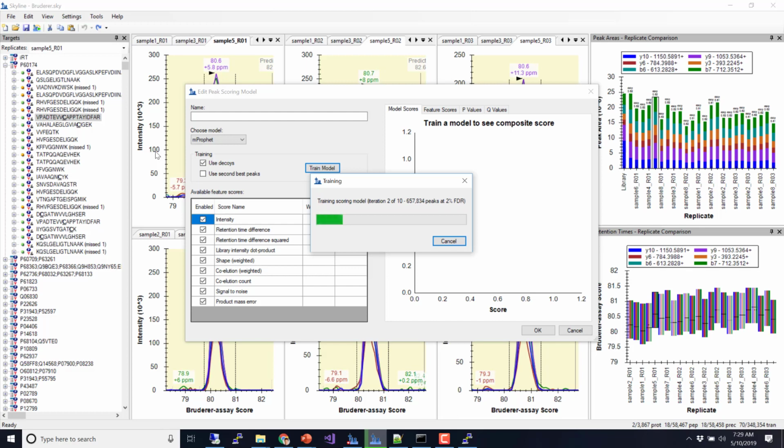So what it's doing is it's now learning this model, and it's got almost 1 million peaks at a 2% FDR. It starts at a 2% FDR, and it's doing this linear discriminant analysis, and it's learning weights for all these scores, and then it switches to a 1% FDR, and it loses some, and then eventually, when another round of learning does not increase this value, that's what just happened. So it's done. So it's 5 iterations done. I can't do any better than this.